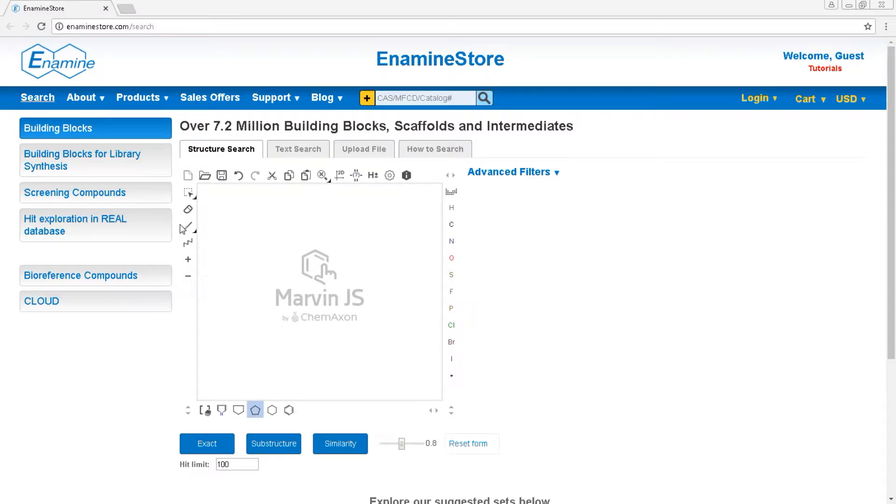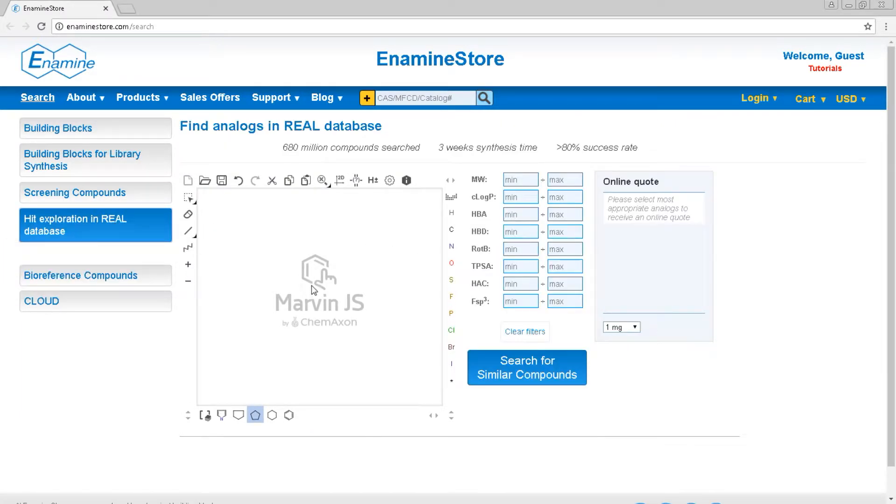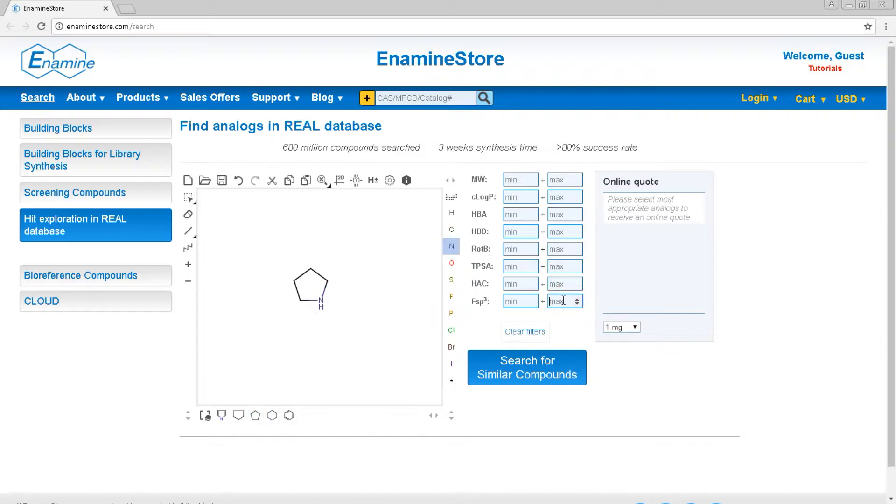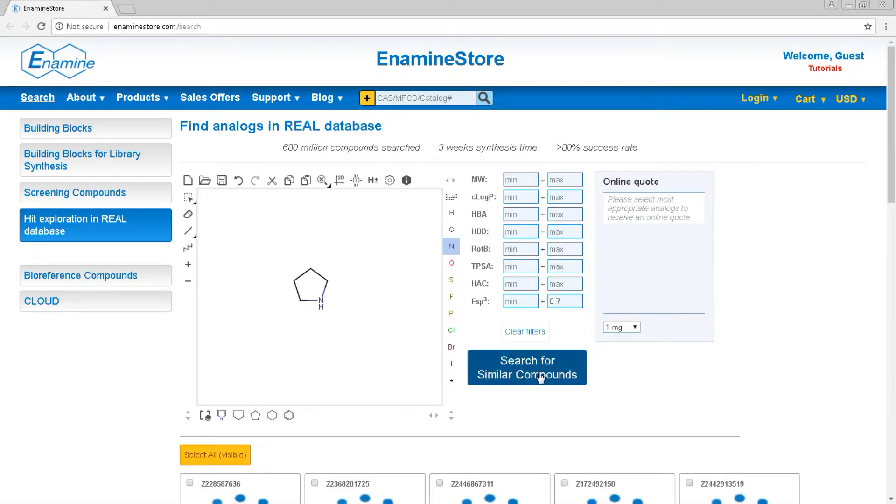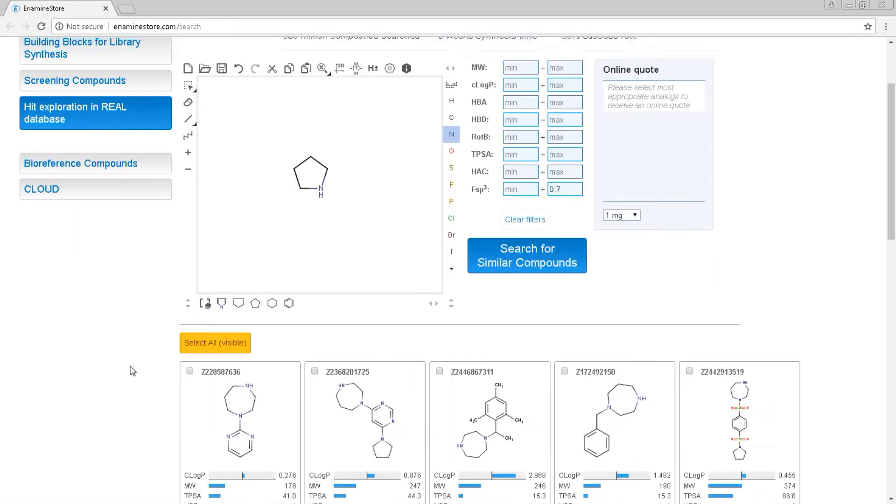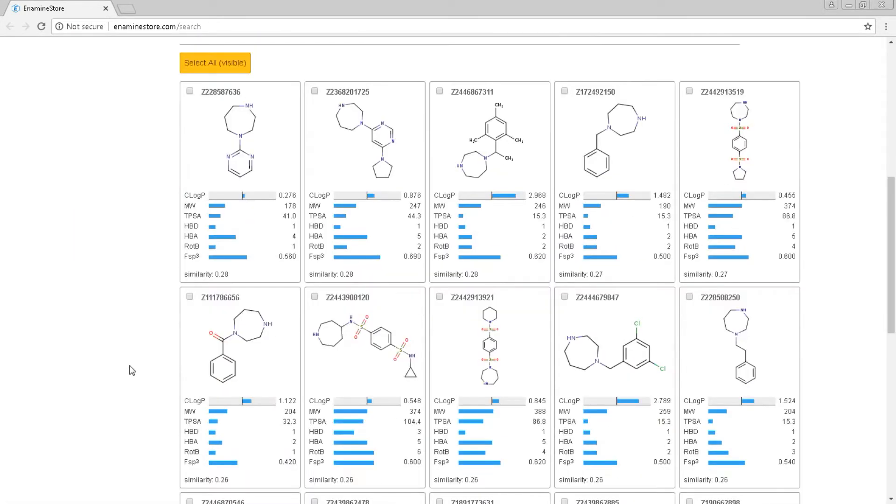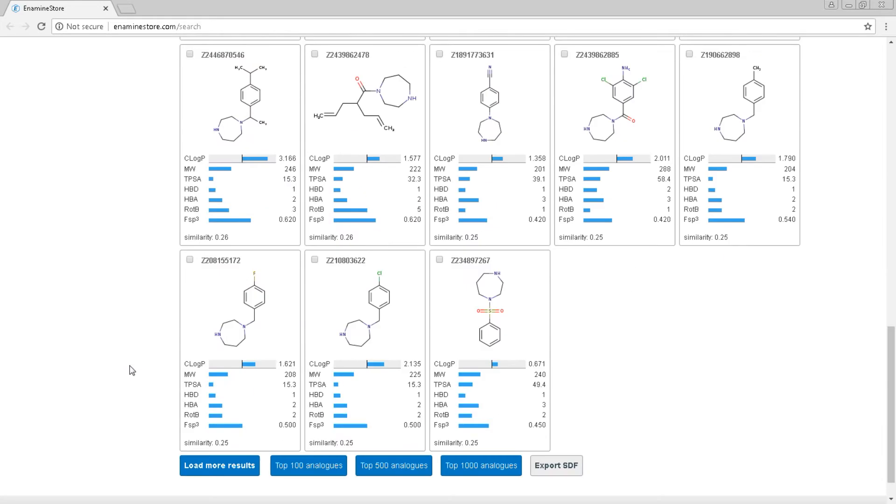You have to go to hit exploration mode and then draw a molecule. You can select a range of medicinal chemistry parameters here to narrow down your search. Hit the search button so the search results are popping up below.